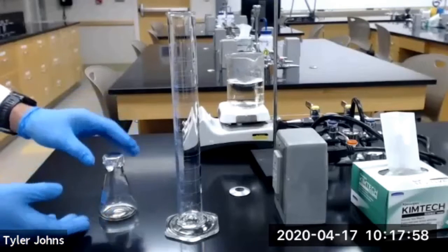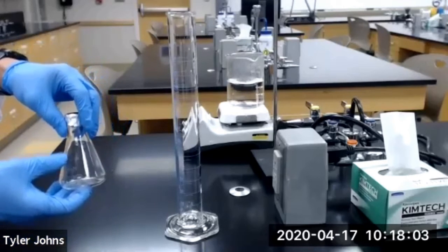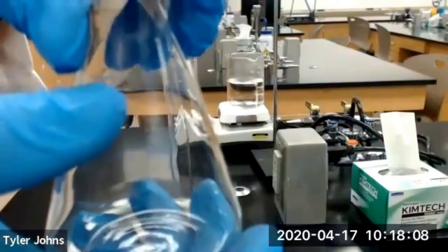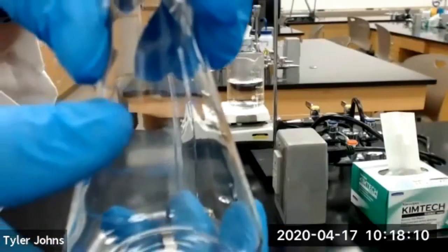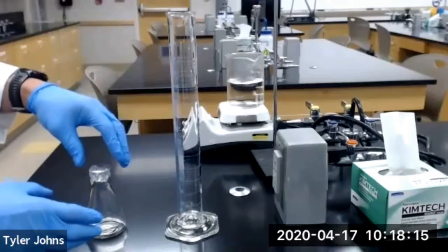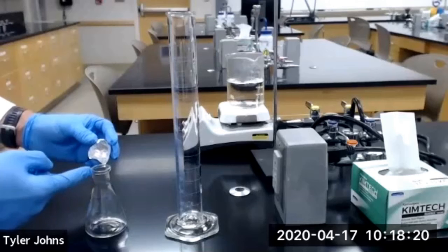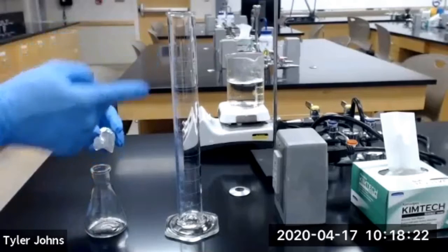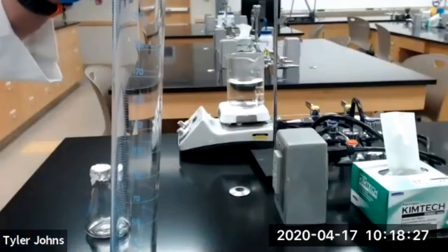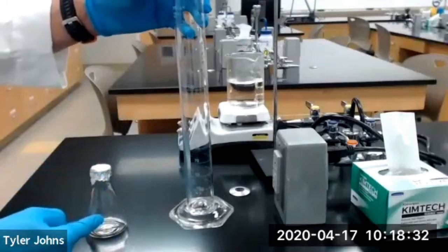Next we need to determine the total volume that is in this 125 mL Erlenmeyer flask. As you can see, the 125 mL mark is not at nearly the top of the flask. So what I'm going to do is take water, fill the Erlenmeyer flask to the very top, and transfer it into a 250 mL graduated cylinder to determine the accurate amount of volume that this Erlenmeyer flask holds.